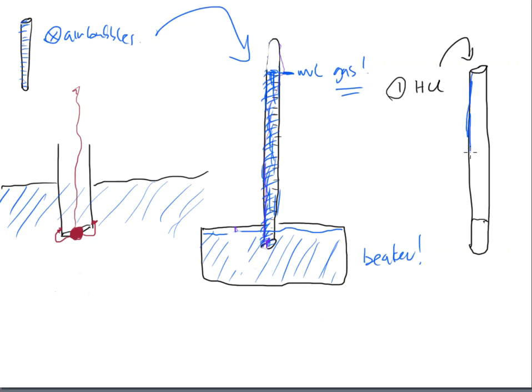And then it says take a sprayer, and along the edges of the eudiometer, we are going to fill this eudiometer up with water. So in other words, I don't want to spray it in the middle. I don't want these things to fully mix. The HCl is slightly denser than the water. It's going to settle to the bottom as much as possible. And the least amount of disturbance that you can give it, the better off you're going to be. So as the water trickles down the eudiometer, we want to overfill that eudiometer all the way to the top with water.